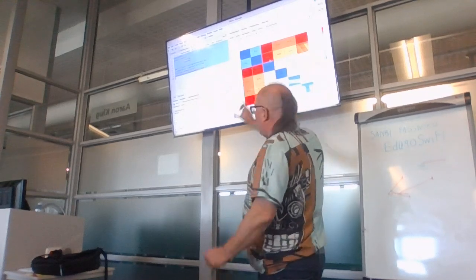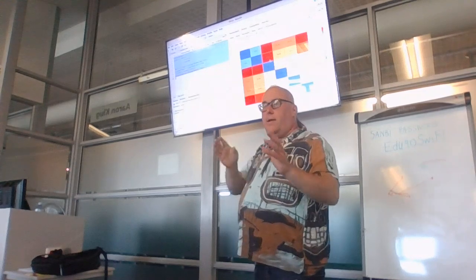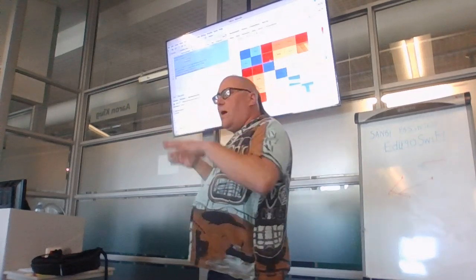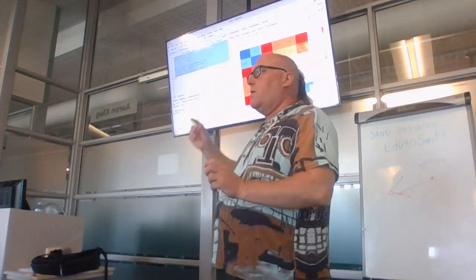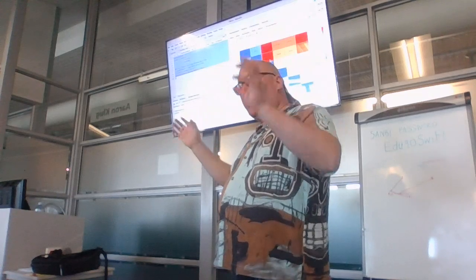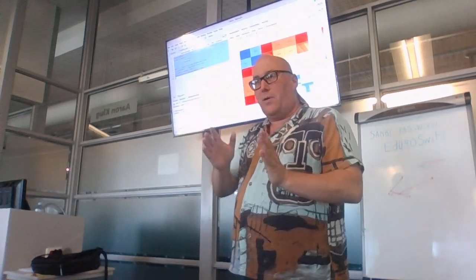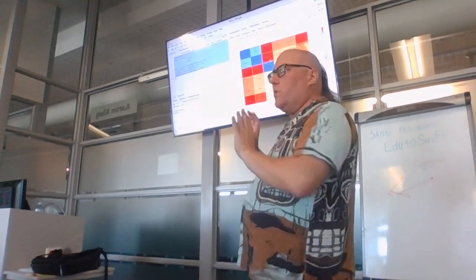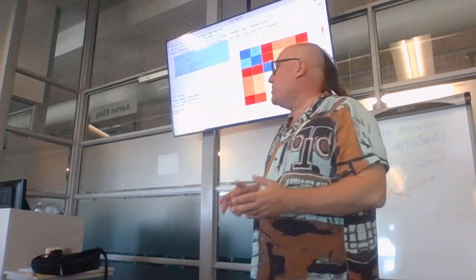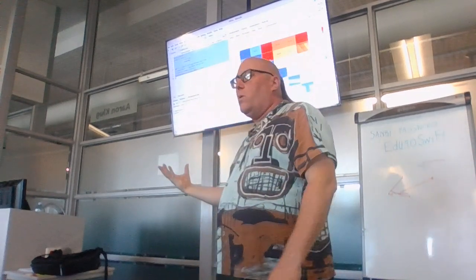So the two clades have different amounts of SNP difference. This is still not putting time onto the tree, but it does show us that we have kind of two different sampling points in a way, because there's one group like this and another group like that. And since I happen to know that these were collected at different times, it may be the accumulation of mutations over time.